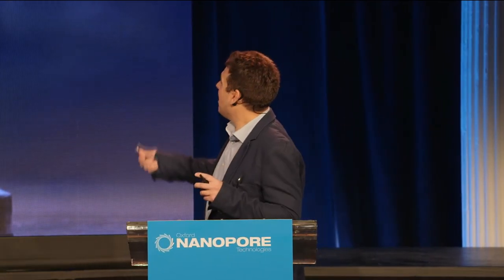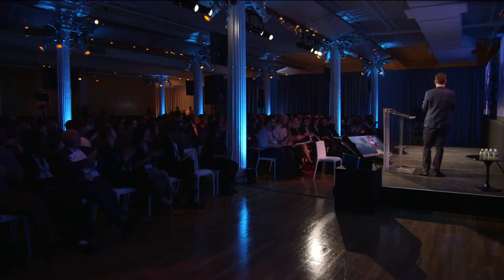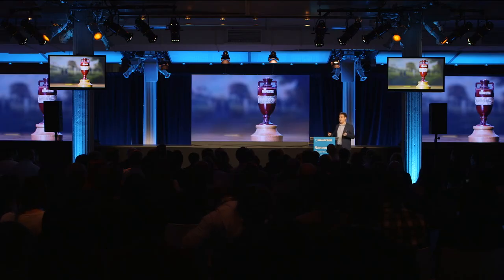Now, I put the Ashes up here because I thought it would be quite a good gag to present one of these urns to Martin Smith, who recently beat our record. So our longest read at the current time of printing is 950 kb, and I think Martin's recently recorded a 970 kb read. So, well done, Martin. And I thought it'd be a good gag to get a replica of this trophy and bring it, but it was 70 quid. For a cheap gag, I'm not spending 70 quid. But Gordon has said he will buy a replica Ashes urn for you, and you can receive it. But then when someone beats that record, which will happen soon, we'll have to get another one.